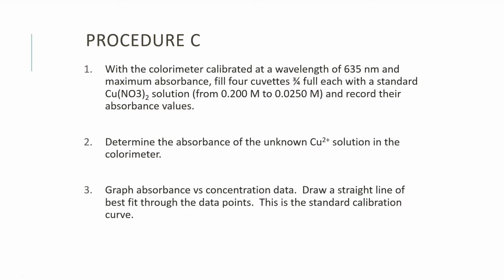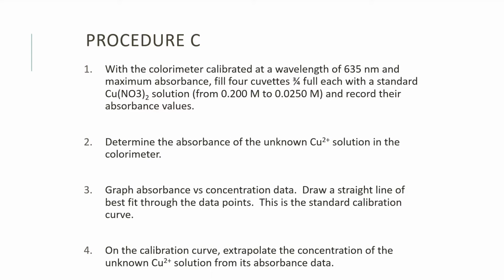Once all of the solutions' absorbances have been recorded, use the data collected to graph the absorbance versus concentration. Then draw a straight line of best fit through the data points, and this is the standard calibration curve. On this calibration curve, extrapolate the concentration of the unknown Cu2+ solution from its absorbance data.